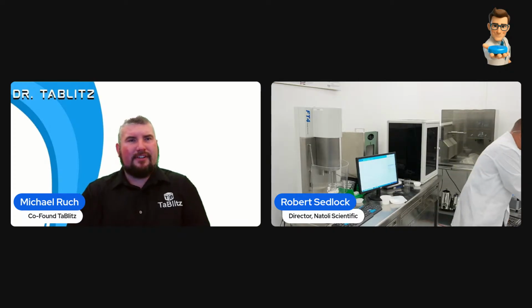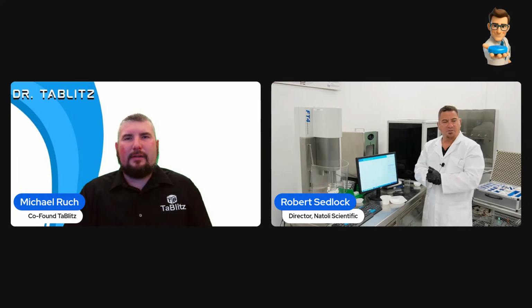So yeah, everybody, if you haven't figured it out by now, episode 6, we're going to go over powder rheometer technology and what to do with it, why it's important, how to understand the data, and we actually have a special guest we're going to bring on here in a second. So I guess, Robert, we're going to let this thing run, kind of do its business, and then we'll go introduce our special guest.